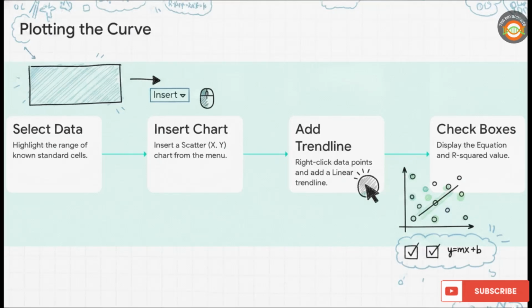So the crucial thing here is moving quickly and cleanly through Excel. First up, you just select your data range with your knowns. Second, hit the Insert tab and click the Scatter Chart option. Third, right-click on literally any of the dots that pop up, select Add Trendline, and make sure you pick the Linear option. And fourth, actually scratch that. This is the most important step. Make sure you check the boxes for Display Equation and Display R-squared value. Boom, just like that, your standard curve is built.